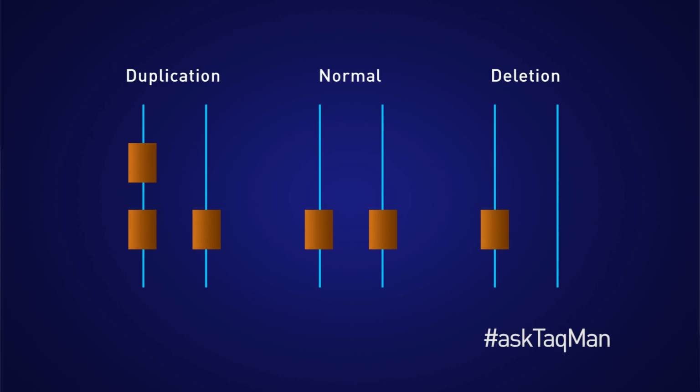Copy number variations, commonly referred to as CNVs, can result in having either too many or too few of a particular loci. Like other types of genetic variation, some CNVs may be responsible for a substantial amount of human phenotypic variability, complex behavioral traits, and susceptibility or resistance to disease.